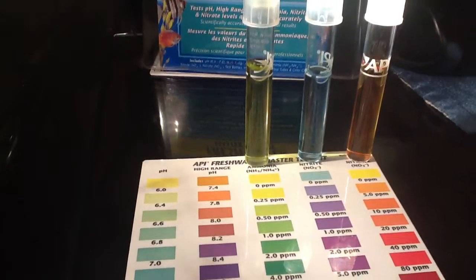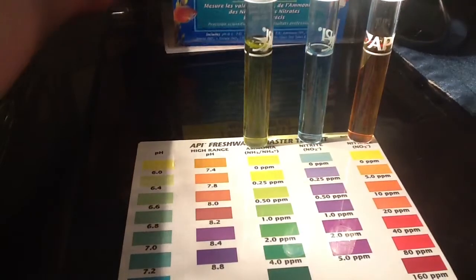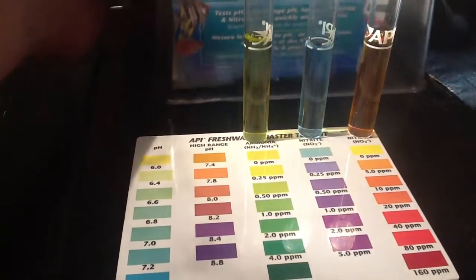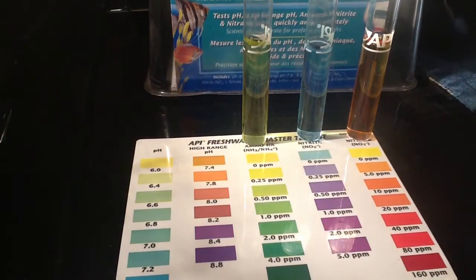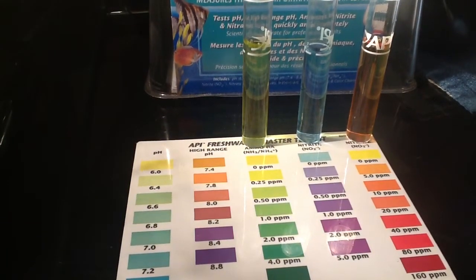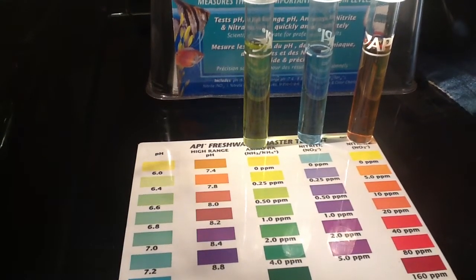Yo, what's up YouTube, Paul Madfish here. A bit of a different video from me this evening. Basically what I've done is I've tested my water - I don't think I've ever shown these results before. I thought I'd show you guys what I've been doing. It's been about 9 days since I last did a water change - naughty naughty me.